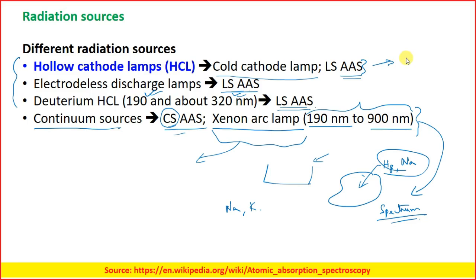However, in these continuum sources you can get the whole spectrum, and from there you can do a quantitative measurement of a metal in a particular ion.